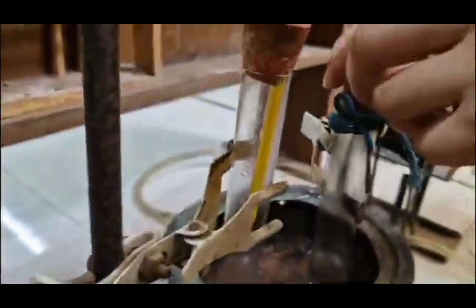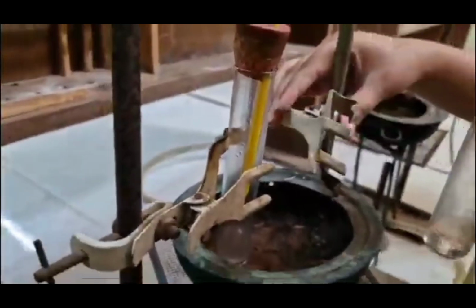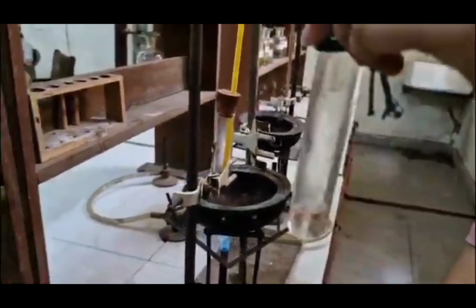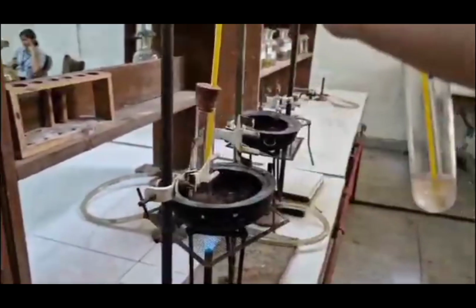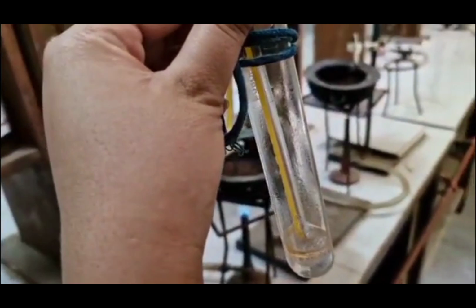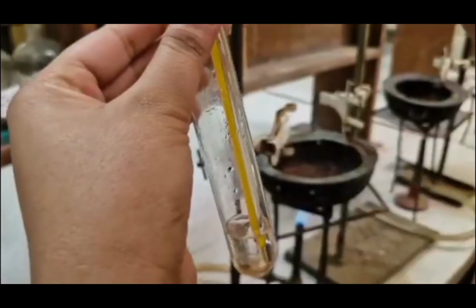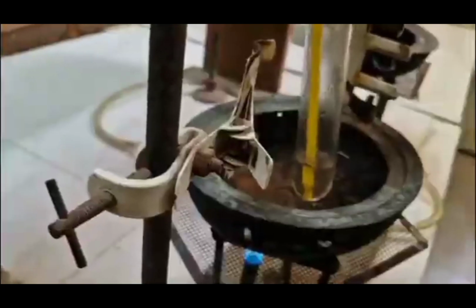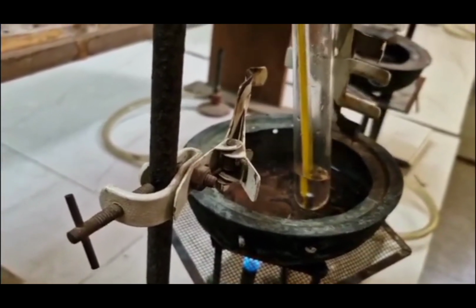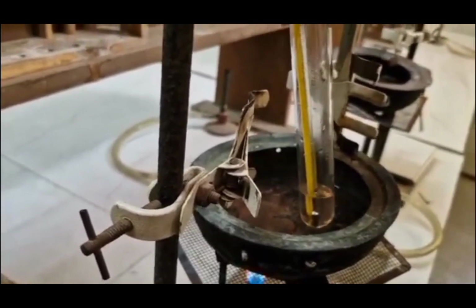Here we can see the effect of NaCl on the CST of the phenol water system. Here we can see that turbidity disappears in the NaCl water phenol system and note down that temperature. Then we will cool it until the turbidity appears and then note down the temperature. In our water phenol system, turbidity also disappears and note down that temperature also.